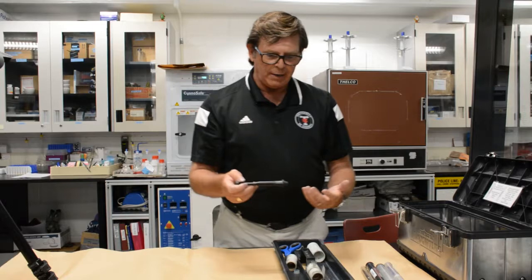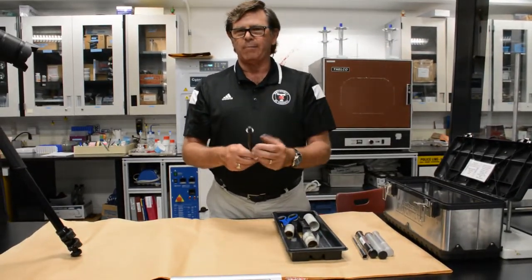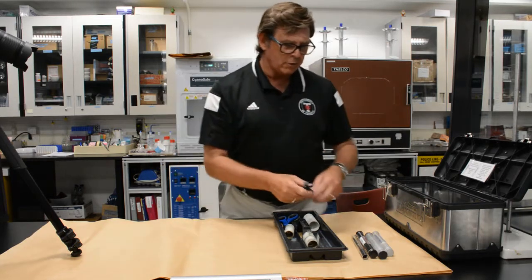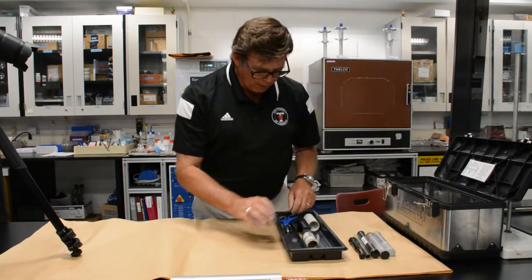So the idea behind this is that it gets used in conjunction with a powder that has a metallic component to it. So the magnetic applicator will work in conjunction with that. We'll demonstrate that as we go through as well.